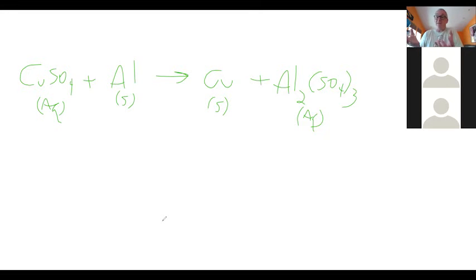We have to have a balanced reaction, because basically, what is the point of this reaction? What are we trying to calculate at the end? What are you measuring at the end of the experiment? The last thing you measure at the end.